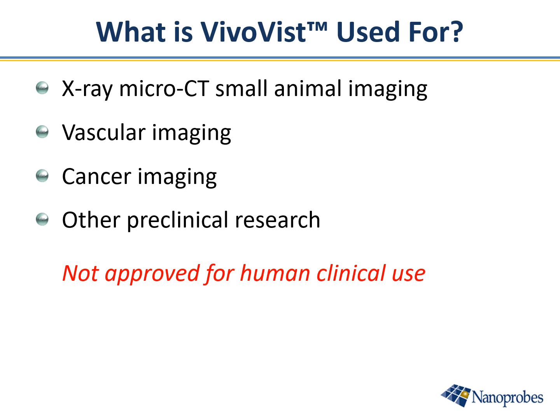One thing to note is that it's not approved for use in people, so it can't be used for human radiological investigations or for diagnoses. So again, none of the materials we're going to discuss today have been approved for human clinical use.